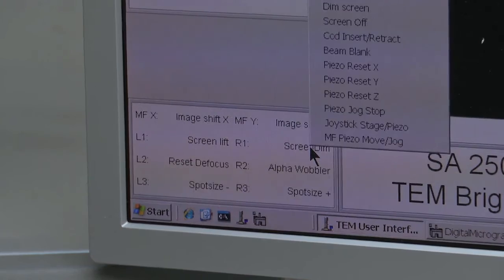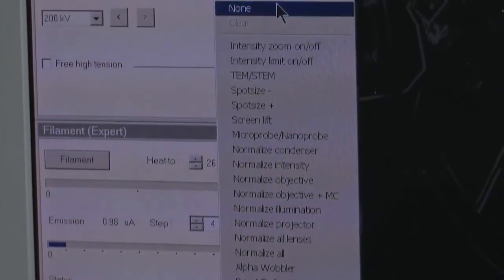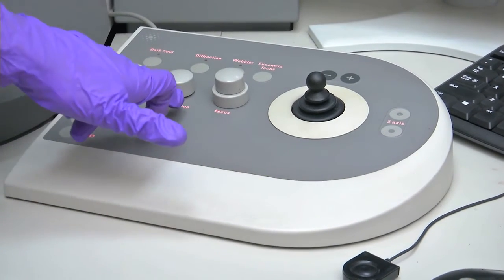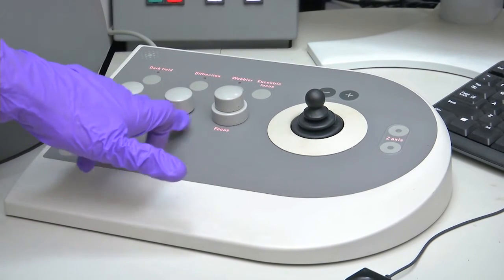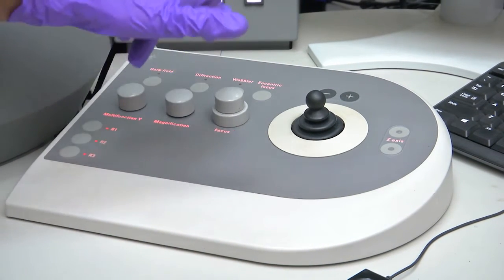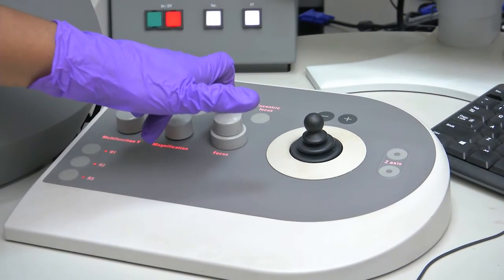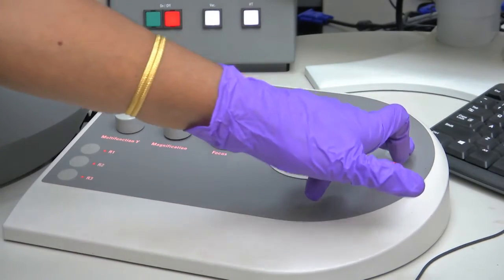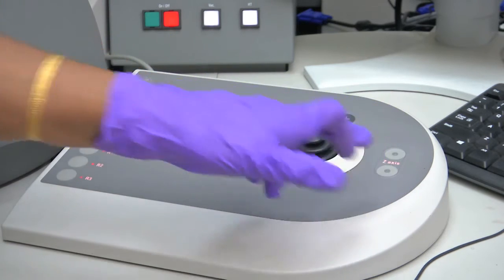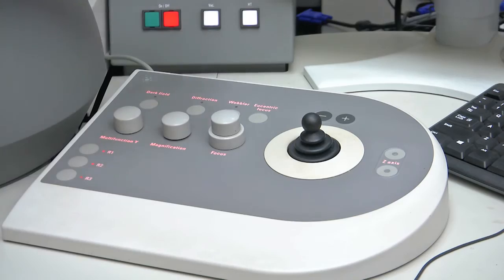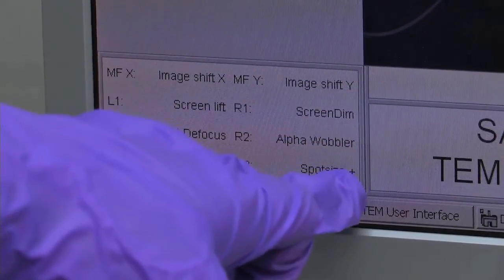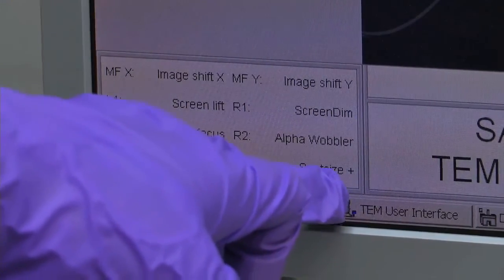These are optional buttons — by clicking you can select whatever you want, including intensity zoom. This is the multifunction x-direction control. To increase the magnification, use this knob; the same coarse and fine focusing knob is available. Pressing this takes you to dark field imaging; pressing this goes to diffraction mode. Wobbler and eucentric focus controls are available — for tilting, to keep your area of interest on the optical axis you perform eucentric correction using these two knobs. Optional R1, R2, R3: R1 is screen dim, R2 is alpha wobbler, R3 is spot size — you can select increasing beam diameter using these.